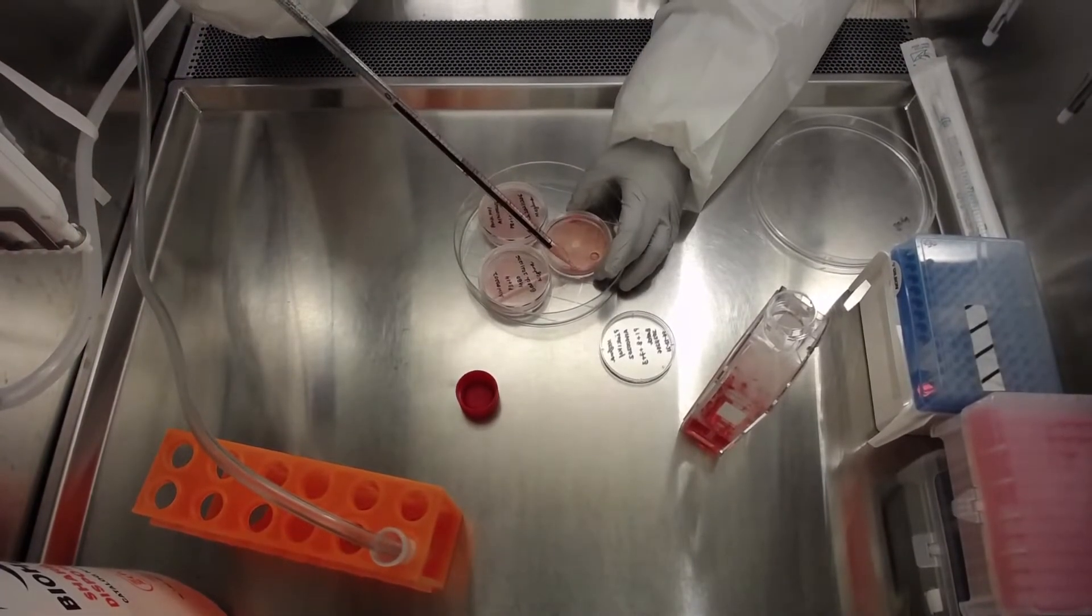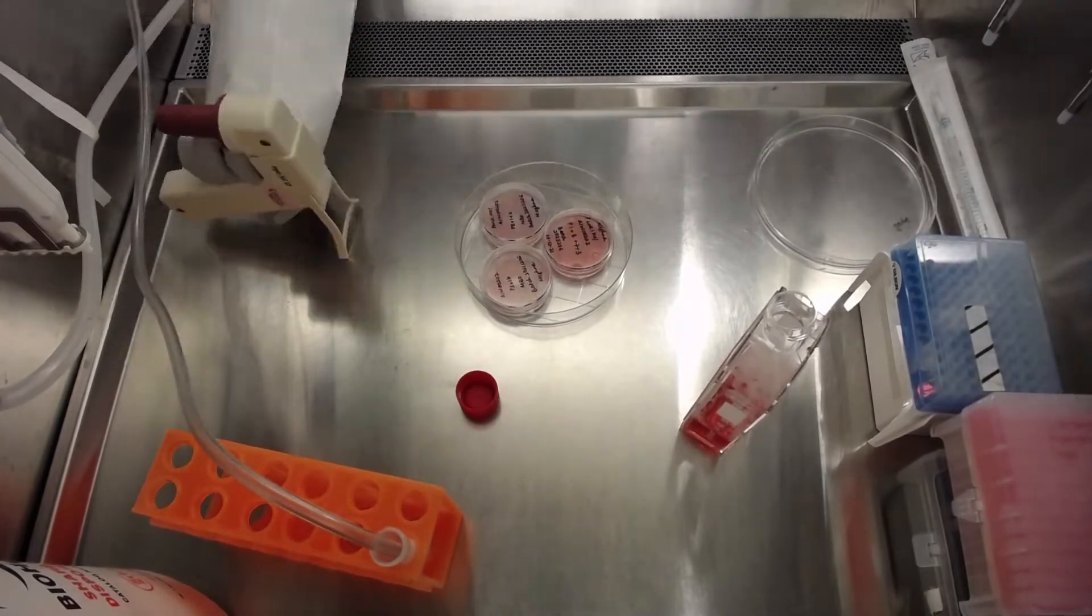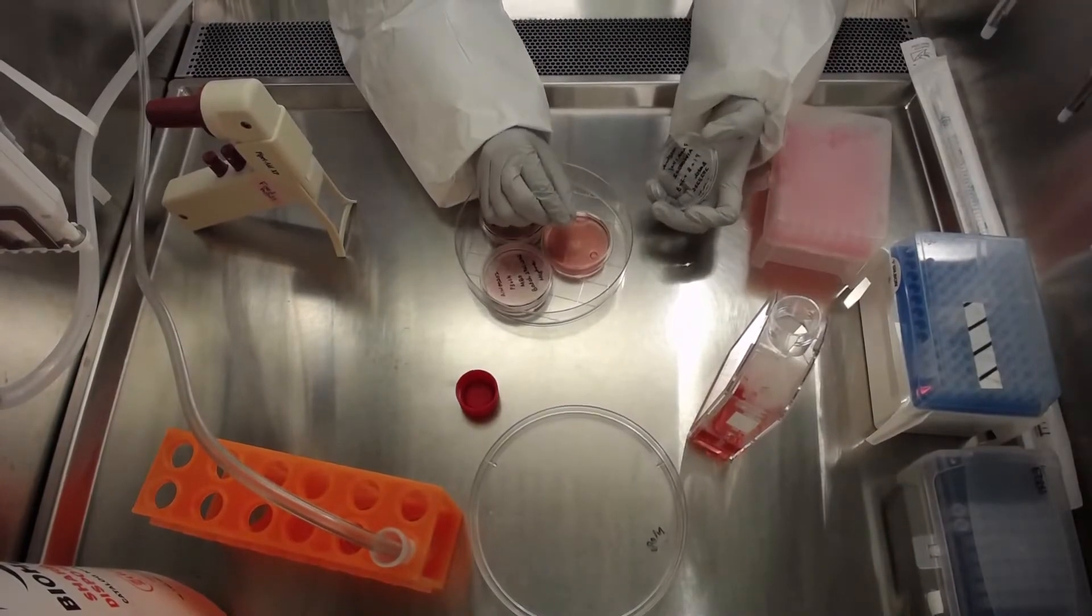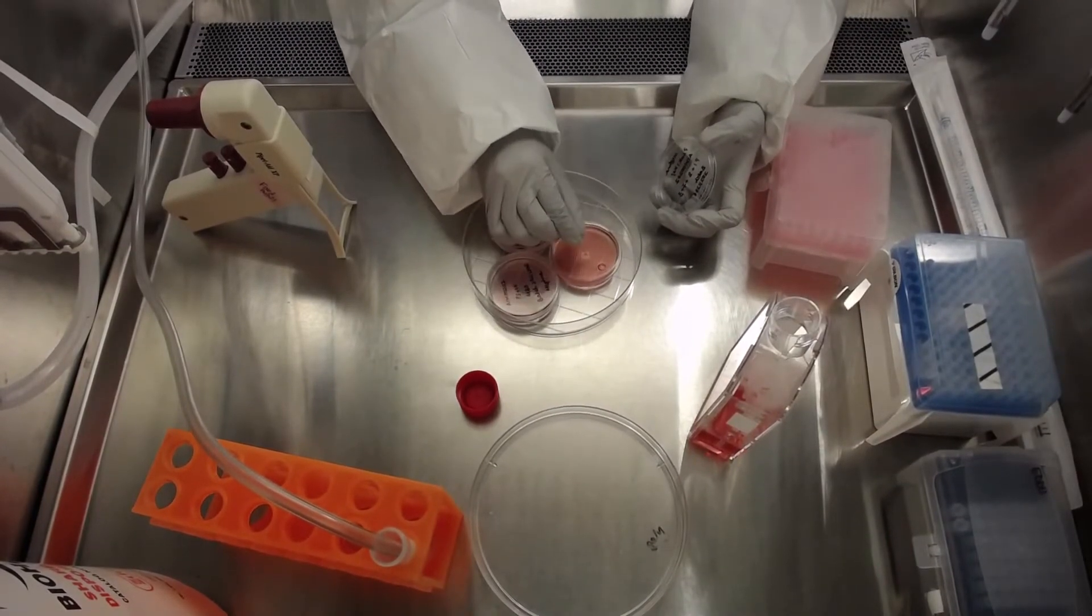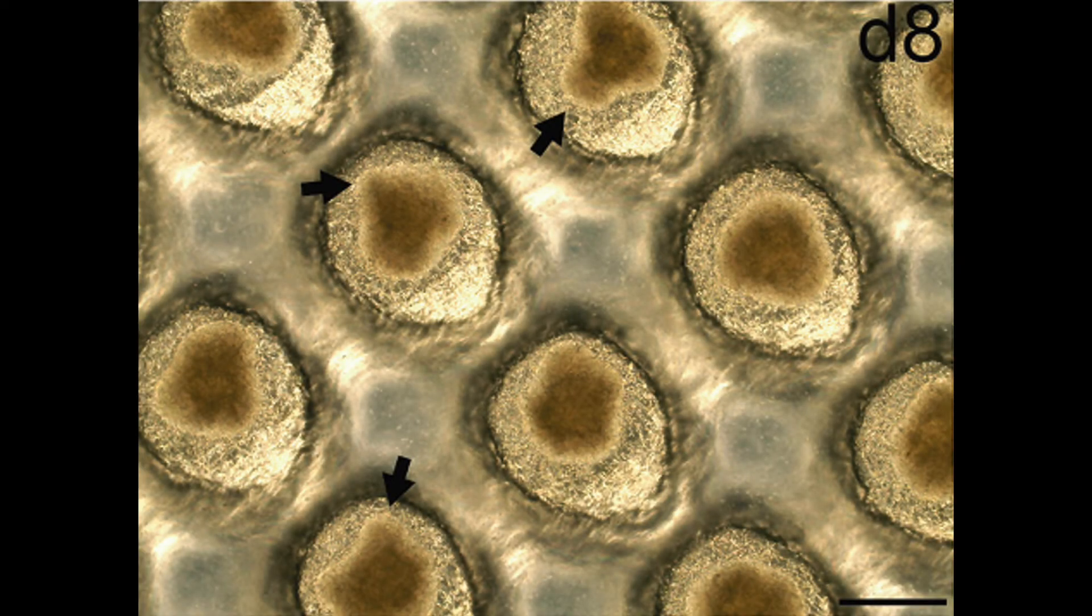Now, complete the volume with 7 milliliters of tissue induction media after the incubation time is complete. Eliminate any existing bubbles. When checking under the microscope on day 8, you should notice that the buds become more pronounced, as mentioned before.